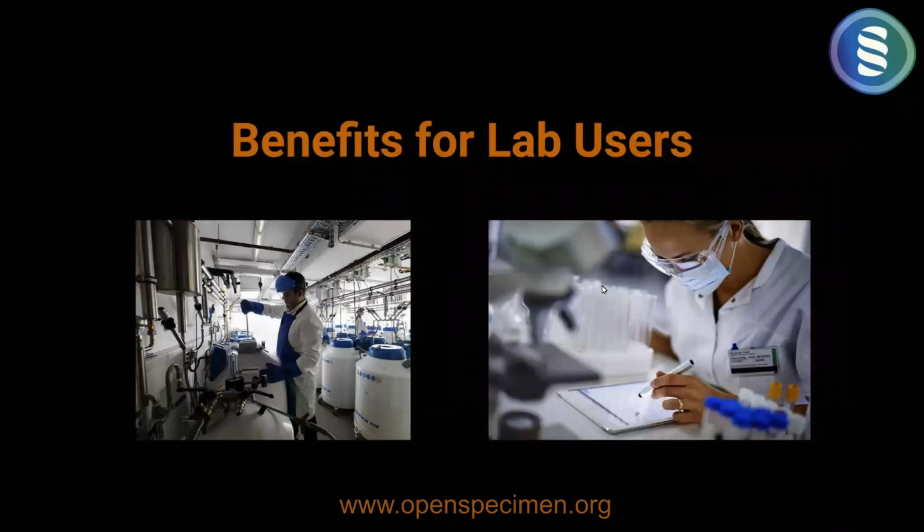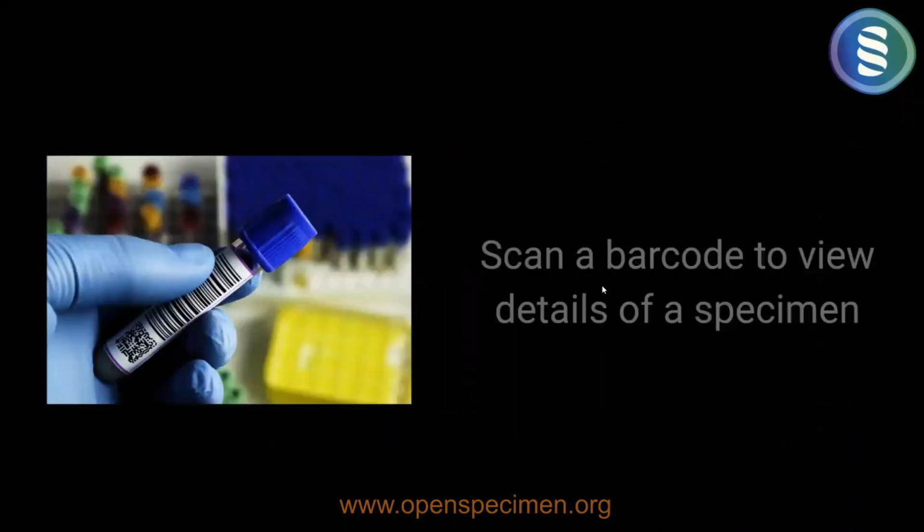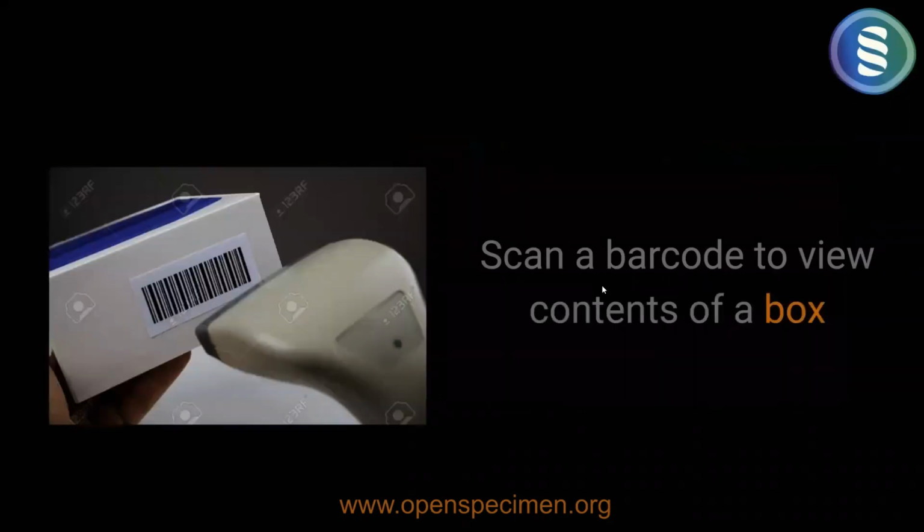Now, if you're a lab user, again, the key feature would be scanning. So you can take out a specimen, scan a barcode, and see the details of the specimen. Similarly, you can scan a box, and this is something that is not yet implemented, but something that we are going to do pretty soon.